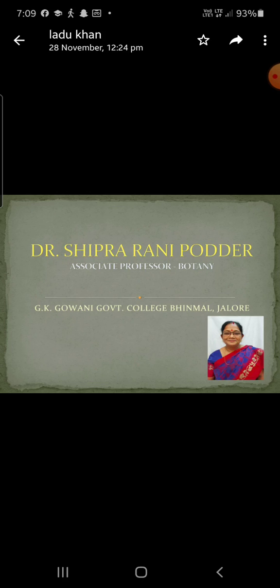There are several vascular bundles in the ground tissue and they are arranged in a typical inverted omega-like arc. The vascular bundles are conjoint, collateral and open, and each is surrounded by a single-layer bundle sheath composed of thick-walled cells. They are diploxylic, that is, they have both centrifugal and centripetal xylem.